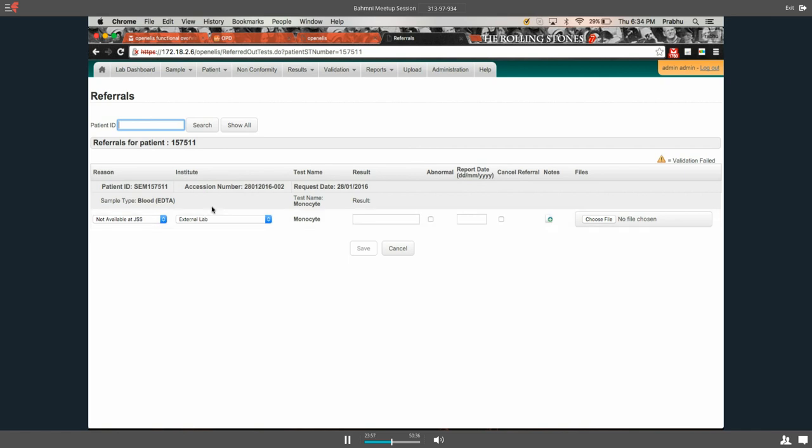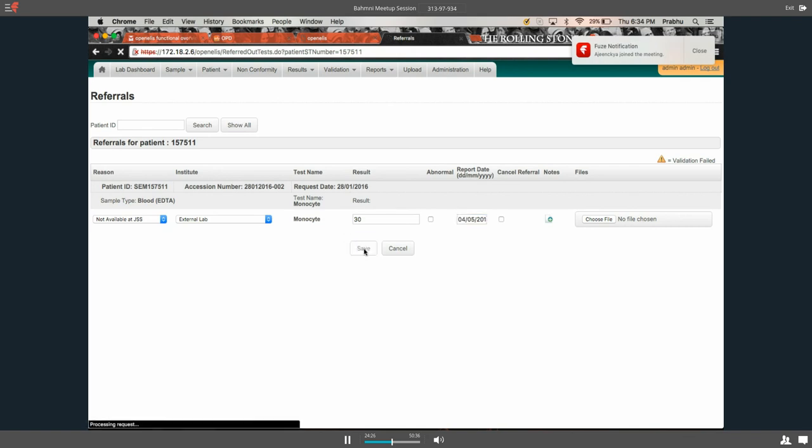Now we see that this is the test that is available, and once the result for this test is made available, you can enter the result and you can give a reporting date for this. Or you can choose to cancel the referral, but at this moment I'll just add this, and then you save the result.